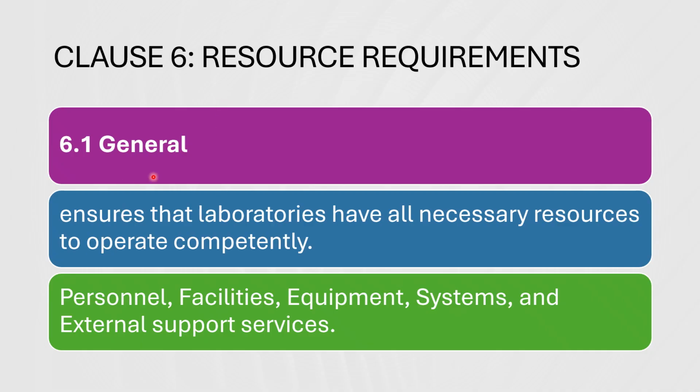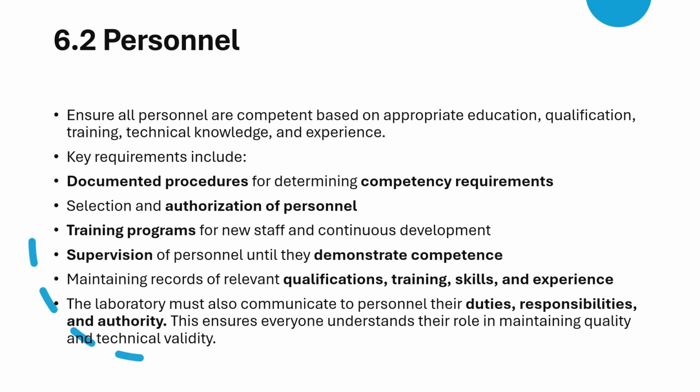6.1 General. This clause ensures that laboratories have all necessary resources to operate competently. The standard requires that resources affecting laboratory activity must be available and controlled. This includes personnel, facilities, equipment, systems, and externally provided support and services. 6.2 clause, that is personnel.